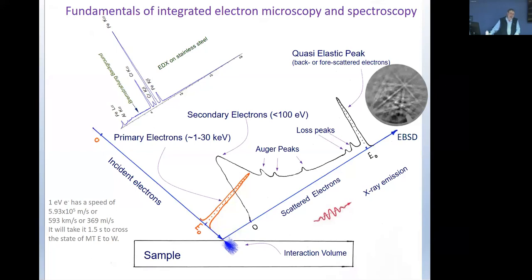A couple percent, yes, we can do quantitative analysis, relative quantitative analysis. The systems are not really meant to be absolute quantitative analysis. So we can tell within maybe a couple percent sensitivity what is there. But if you would like to go more than that, unfortunately, you cannot do that. So you cannot analyze, say, 0.1%, and probably there will be 100% error in that. So a couple percent is okay. We can do, and we can even find them.